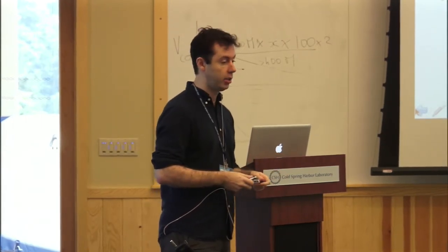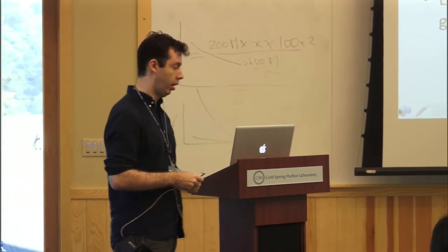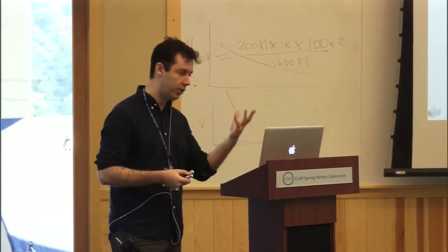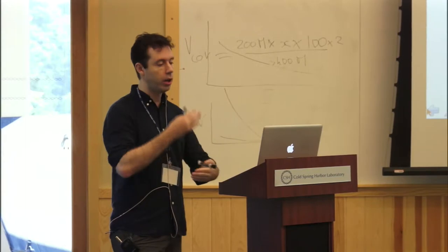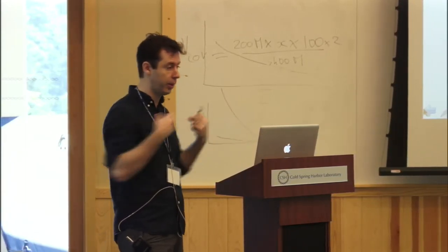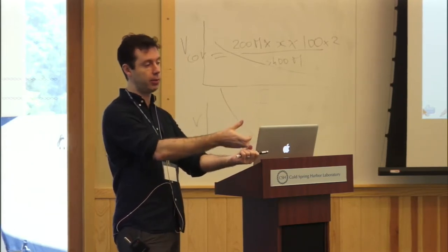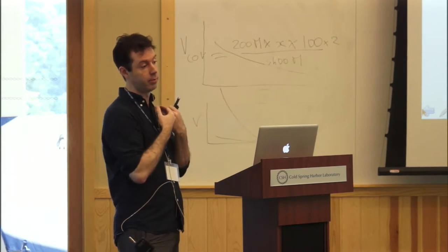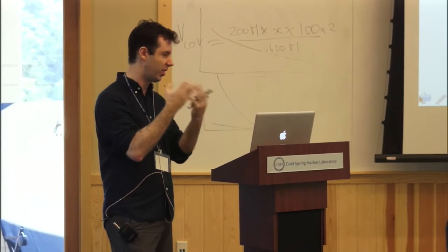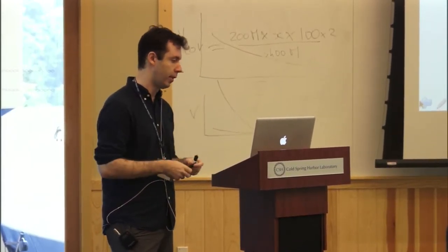But you're right, there are additional issues. For example, GC content is also playing a role. There are regions which have particularly high GC content that are a little bit harder to sequence. Those fragments are fed into the sequencer, but somehow there's going to be a bias against sequencing them. So they're not coming out of the machine. And therefore you see dips in certain types of regions, because the sequencer has trouble sequencing those reads.